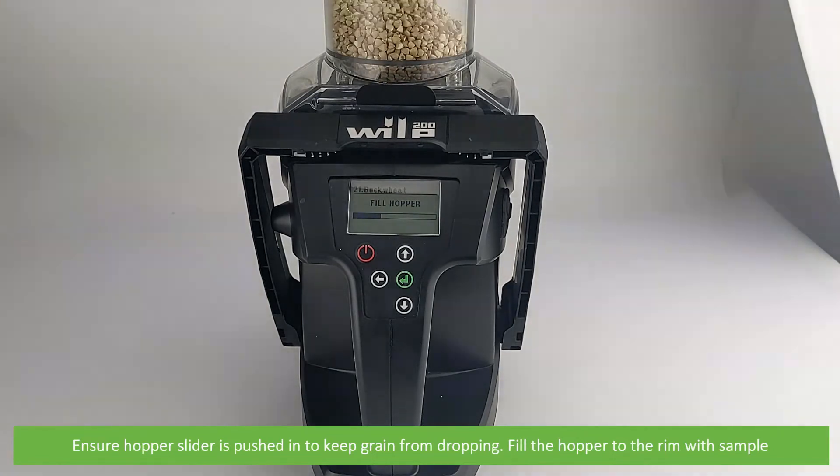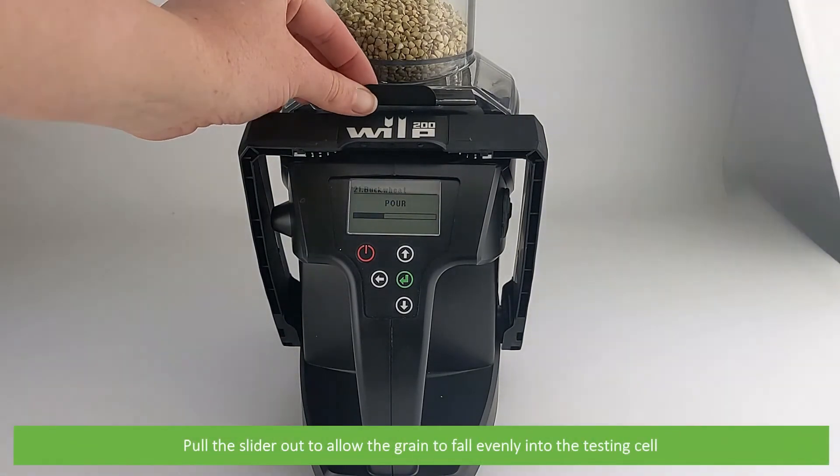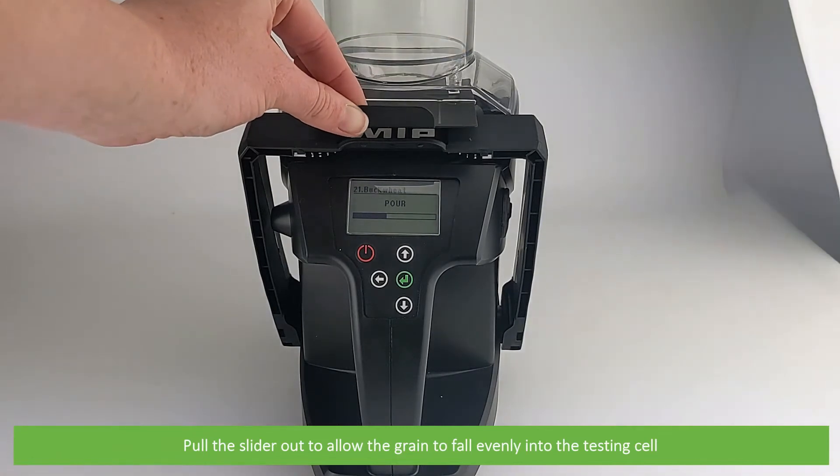Fill the hopper to the rim with sample. Then when instructed, pull the slider out to allow the grain to fall evenly into the testing cell.